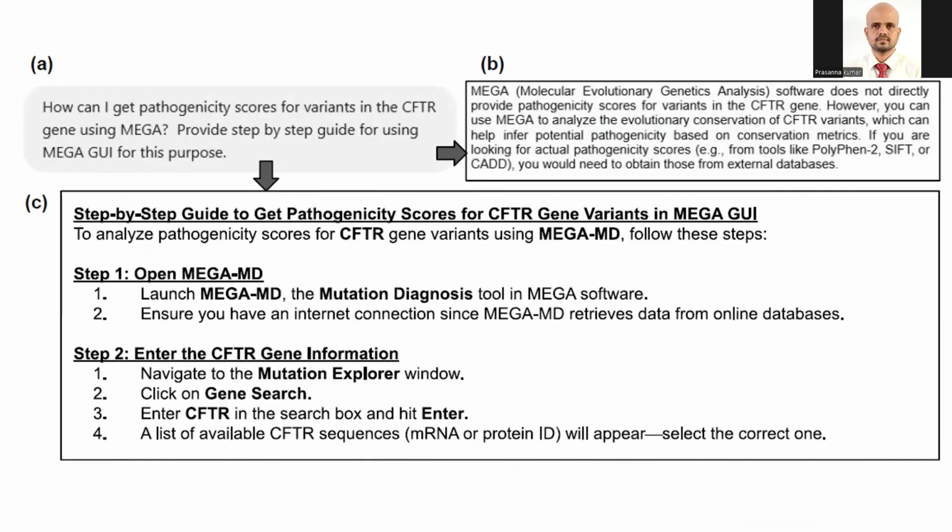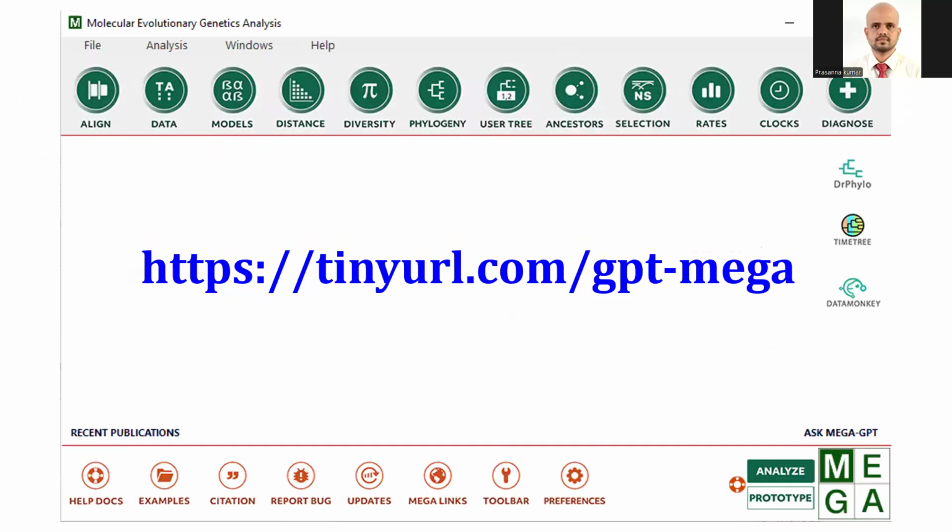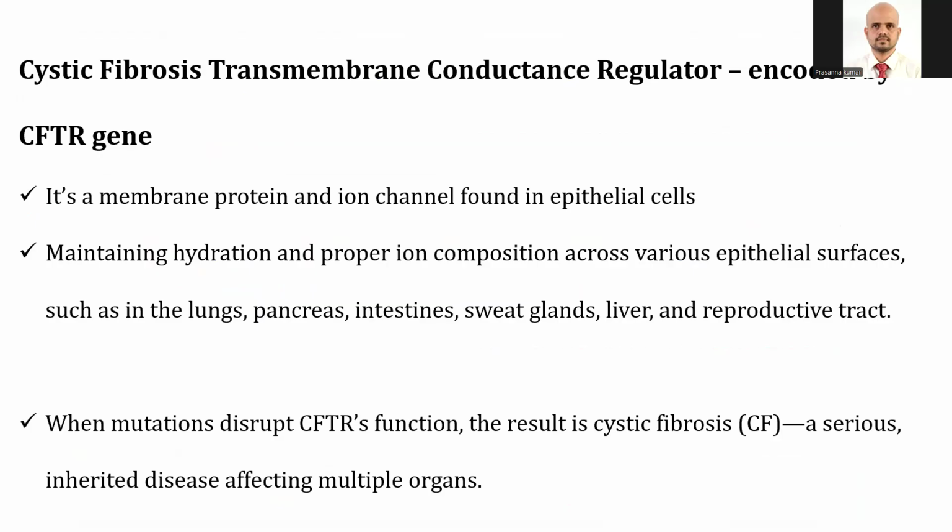Version 12. All right. Before getting into this molecular diagnosis mode, this is an option we will be using. I hear that many bachelor's and master's students are finding it a little difficult to follow the vocabularies. So we thought today we will do some vocabulary check before we get into the actual prompts.